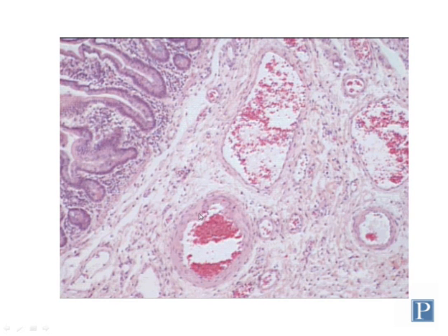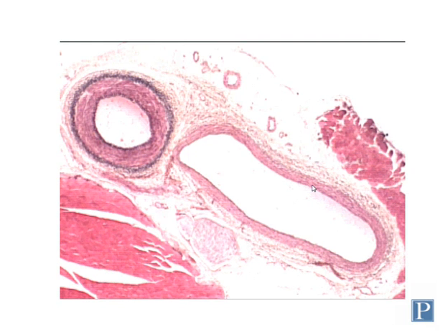Here again is another section in the submucosa of the jejunum. Here's a small artery, here's a small vein, here's another pair, this might be an arteriole and another small vein. One nice thing is that arteries and veins, or arterioles and venules, often tend to travel in pairs. So if you can identify one of the pair, you can often see the other very close to it in that same section.